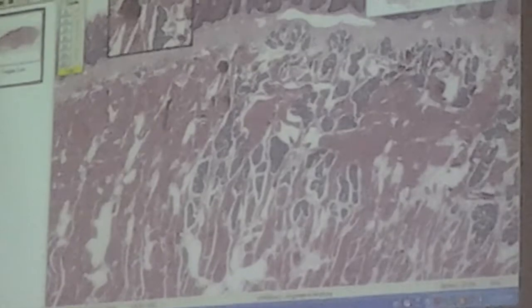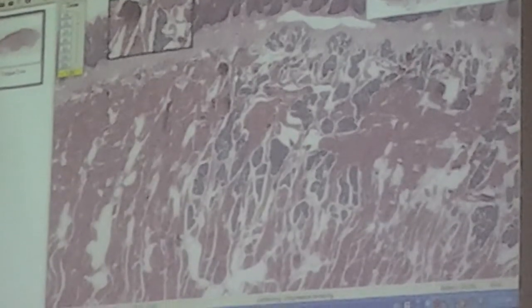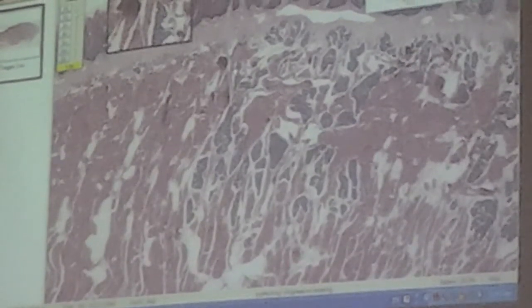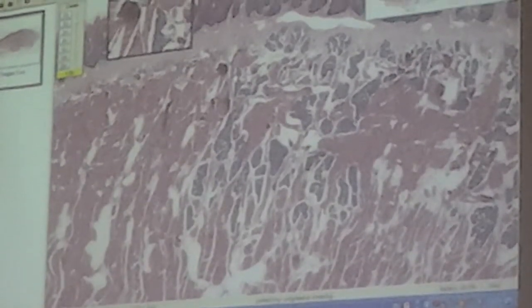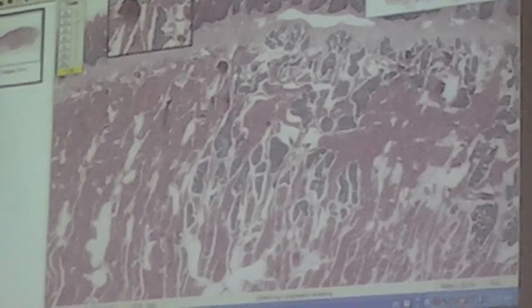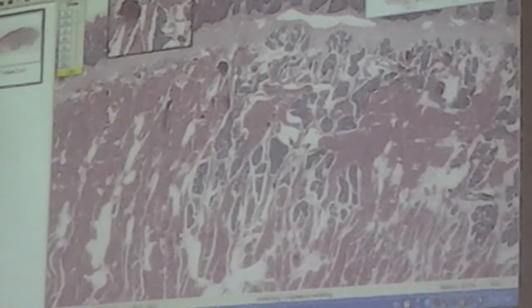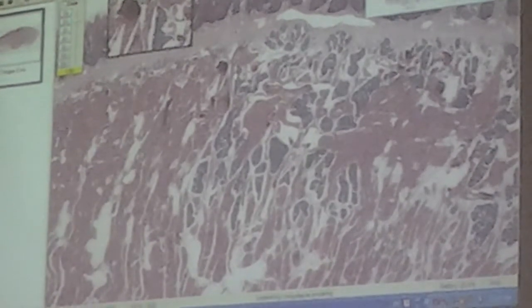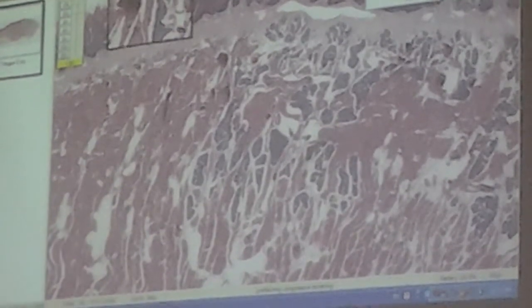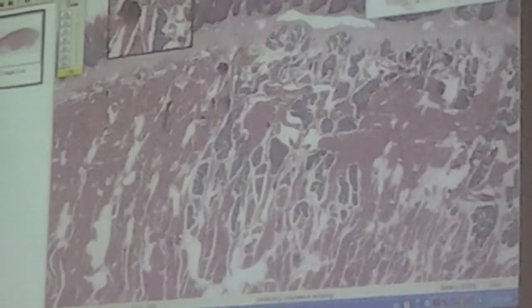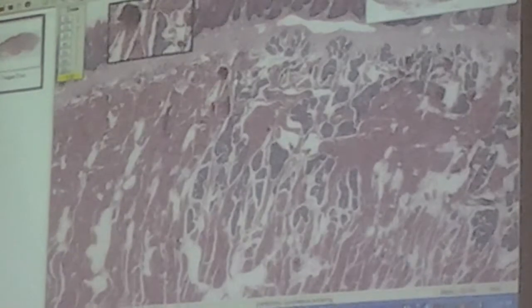Here we see glands. These glands are serous glands; they are basophilic. These glands exist because they should be associated with the circumvallate papilla.